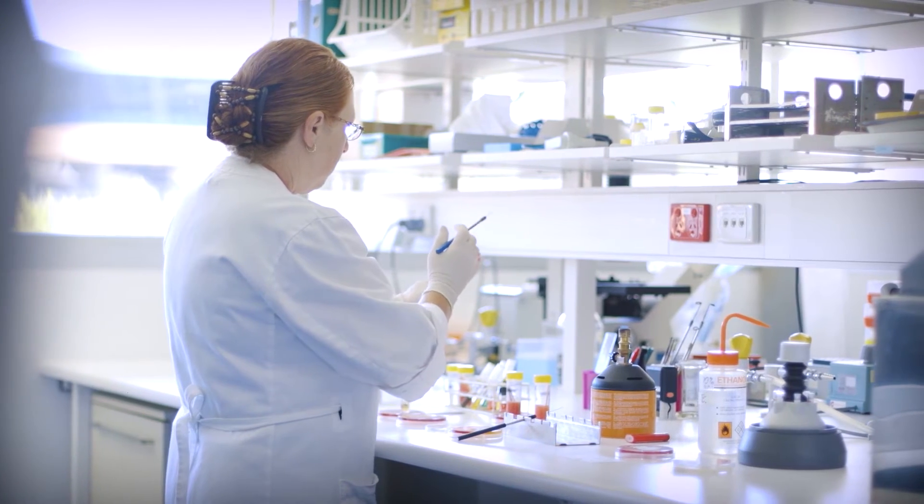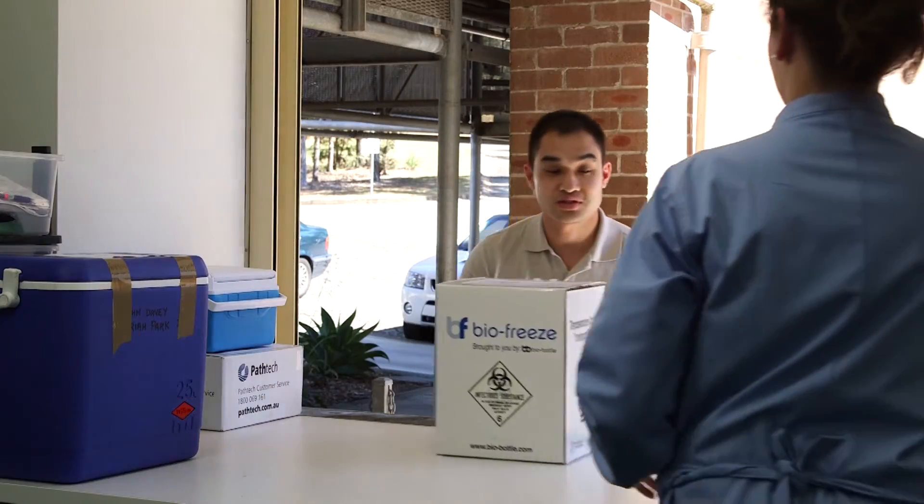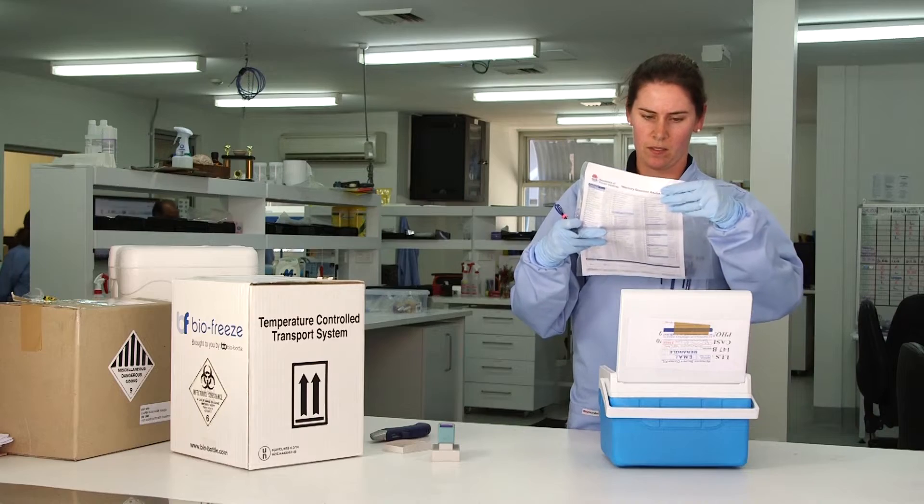Here at New South Wales DPI Laboratory Services we provide a range of diagnostic testing for animal and plant diseases. Our ability to perform accurate diagnostic testing for you depends on receiving fresh, properly prepared specimens accompanied by a fully completed specimen advice form.